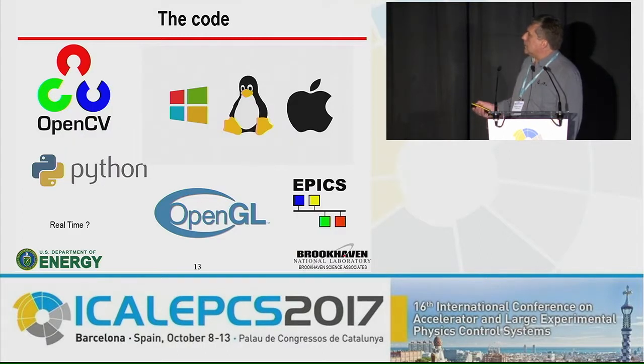We are using OpenCV, Python, and OpenGL for plotting, and this works on all 3 platforms as far as we know. We did test Windows, we did test Linux. I have not personally played with Apple, but I don't see a reason why it would not work. And wherever possible, we do it in real time.